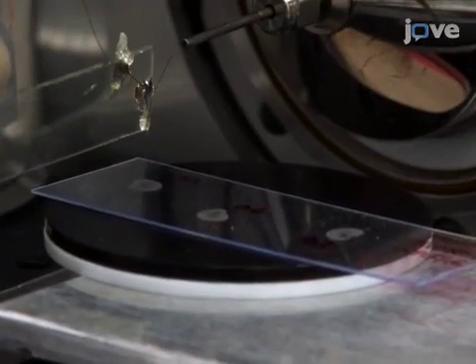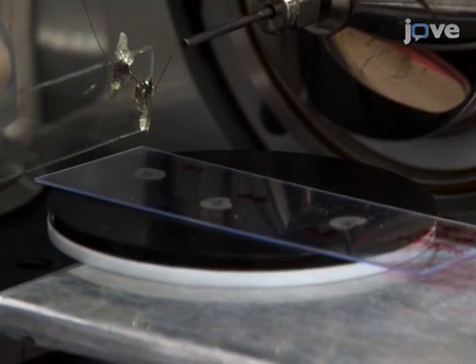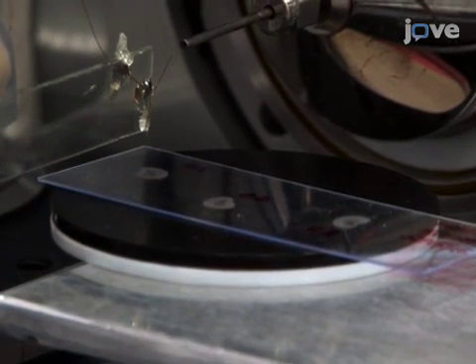Initiate the MSI data acquisition and then construct MS images from raw MS files as described in the text protocol.